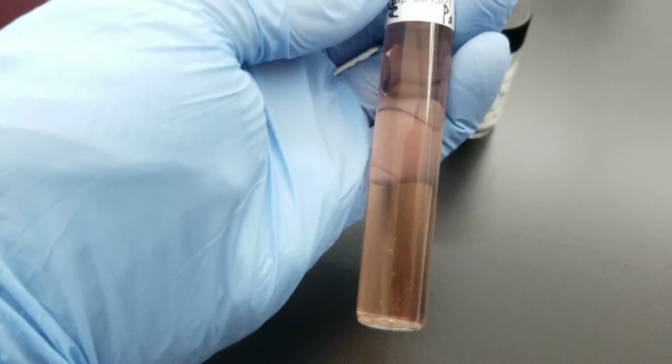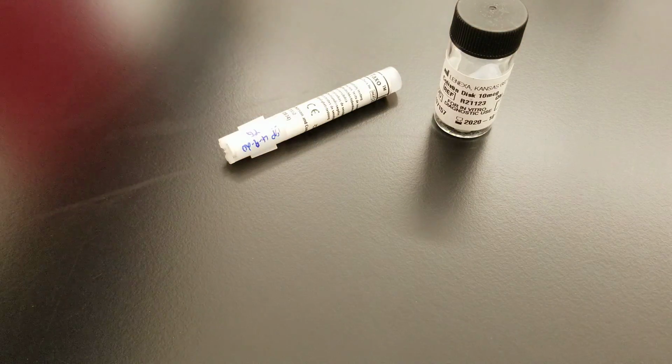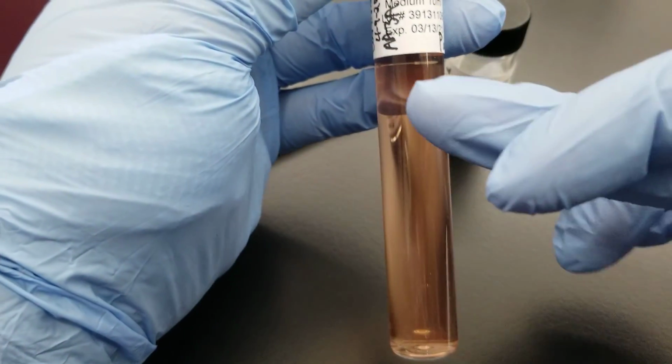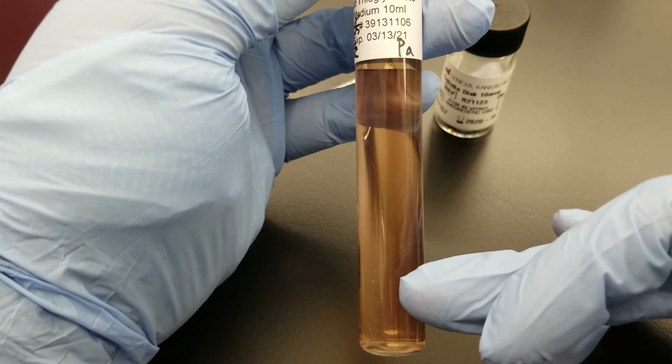So that if you have an organism that maybe is taking a while to grow, because a lot of the anaerobes do grow very slowly and don't immediately grow within that 24-hour period. It may take 48 hours to 72 to a week. You want to make sure that when you put them in the thio, they have all this broth that is nutritional, and they'll end up growing down towards the bottom to make that anaerobic environment that they want.